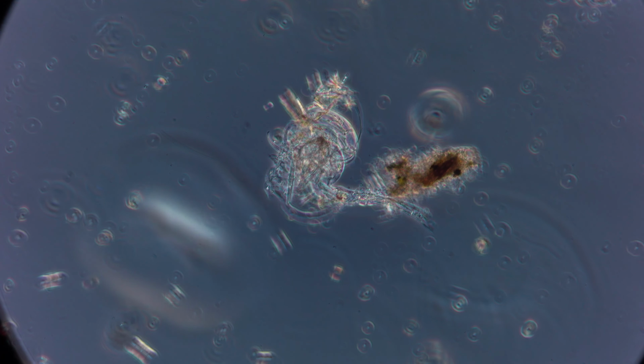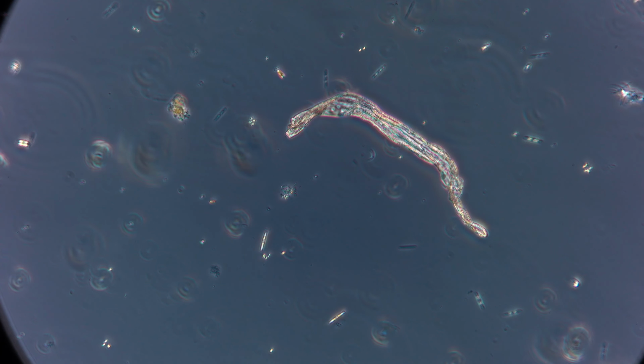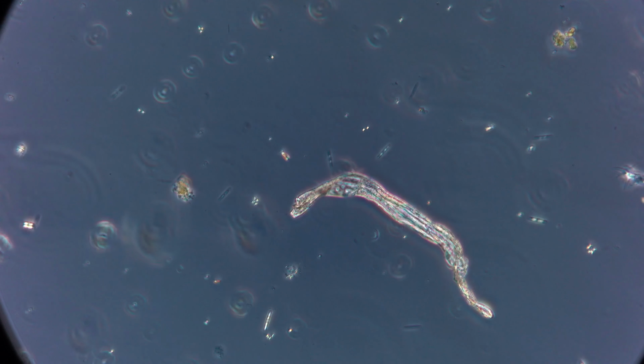I think that's a fungus. The cultures do kind of get fungus sometimes. Microplastic from the Charles. Wait, is that that big thing? Yeah, I find microplastics all the time. So that's fun. There is some little stuff.